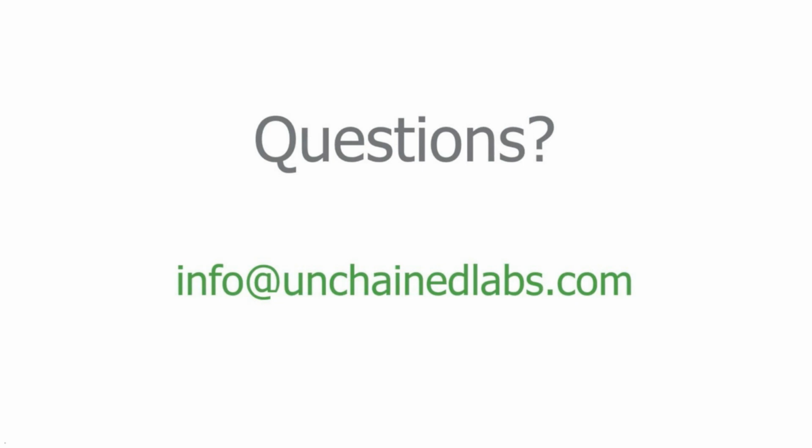Uncle also is really commonly used for isothermal studies too. So if you want to check out, say at 37 degrees C, 40, 45, 50, something like that, and look at DLS over several days, this is another good way of checking out stability and aggregation on the Uncle.